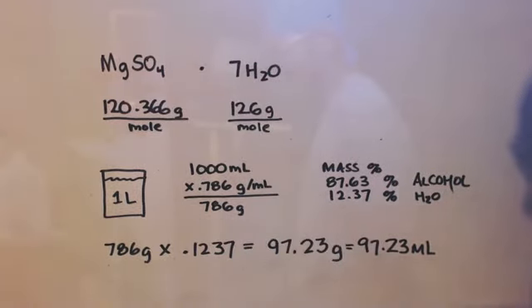Now keep in mind, if you're recycling things like solvents, like isopropyl alcohol, if you distill this, you're not going to distill it to 91% azeotrope. I hope people understand that, especially if you do a simple distillation. It takes probably 3 or 4 plates to do that, which means you'd have to distill it 3 or 4 times with a simple distillation.